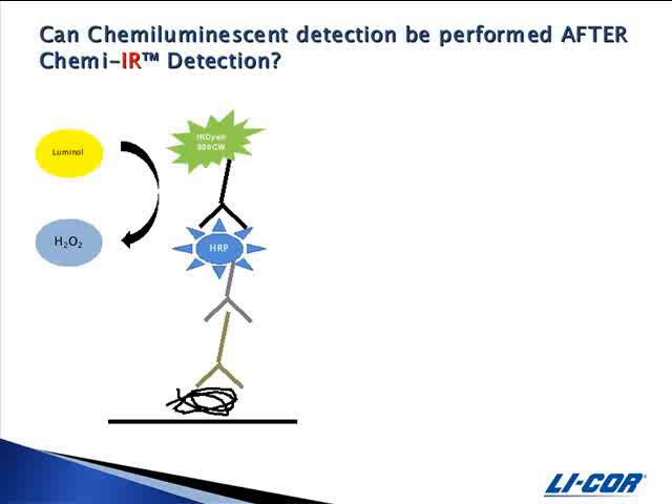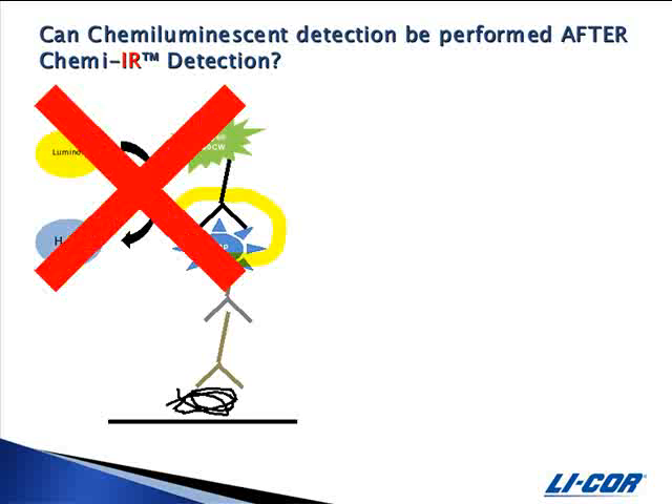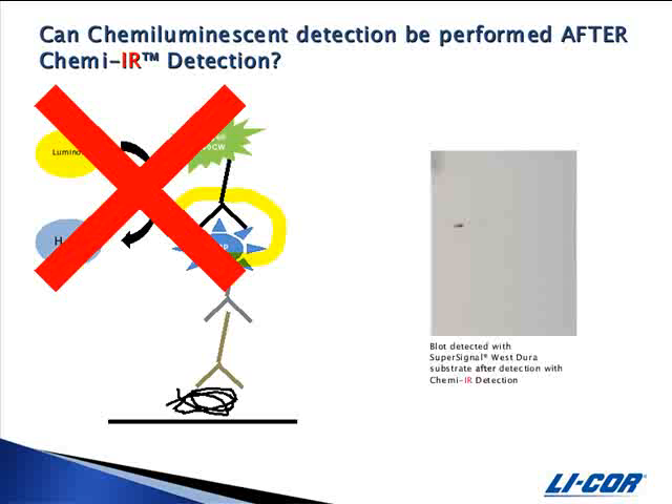Can chemiluminescent detection be performed after ChemEIR detection? Once the ChemEIR antibody has bound the HRP conjugate, the HRP is no longer available as a catalyst for the chemiluminescent reaction. The blot shown is the same blot from the previous slide but detected with SuperSignal West Dura substrate after ChemEIR detection. You can see that the signal has been greatly reduced and that most of the bands do not show up.